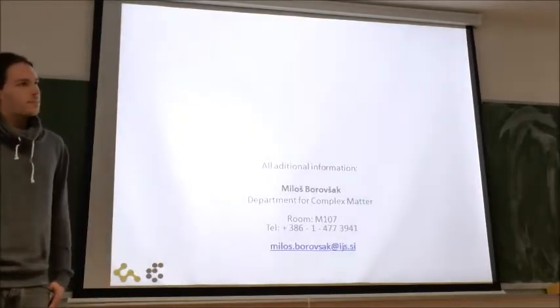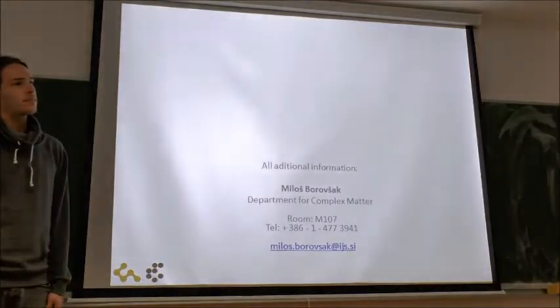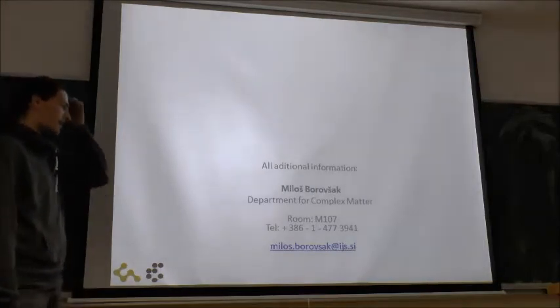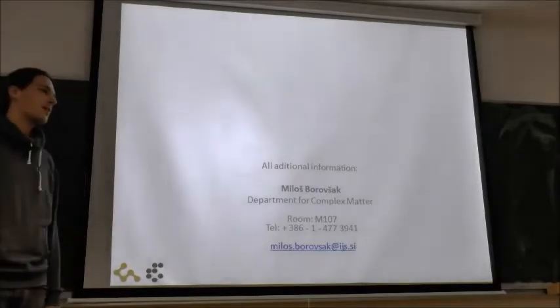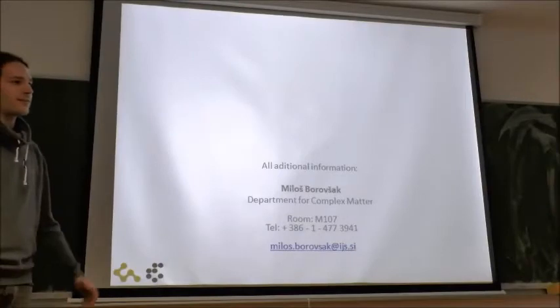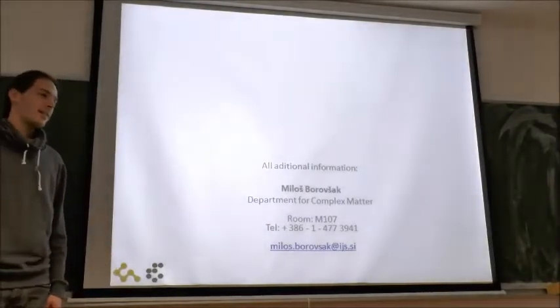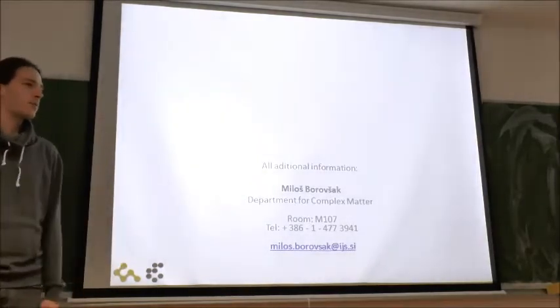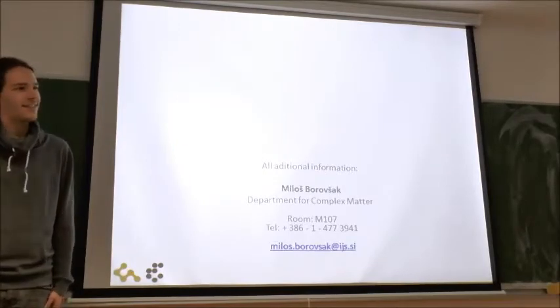Okay, but you mentioned that you measured only at room temperature, because I did not get the connection between Raman and this. Yes, the Raman and the AFM can be measured only at room temperature. But the micro Raman, which is also part of the system, has the cryostat, so we can measure there. In this AFM and Raman, we can have a controlled atmosphere. But it's too expensive, I mean, 600,000 for this.